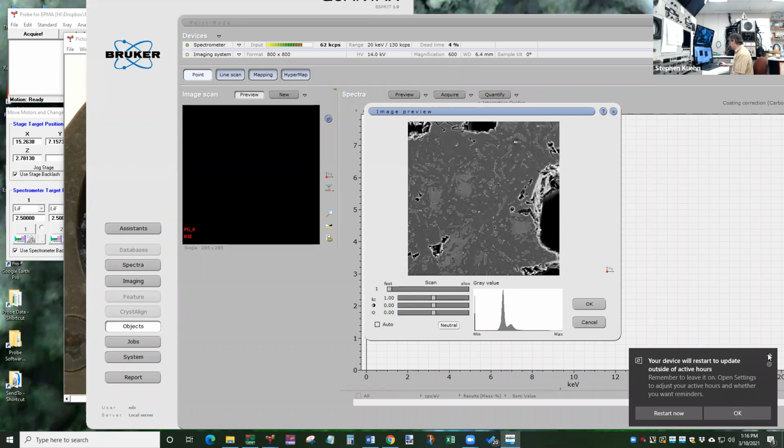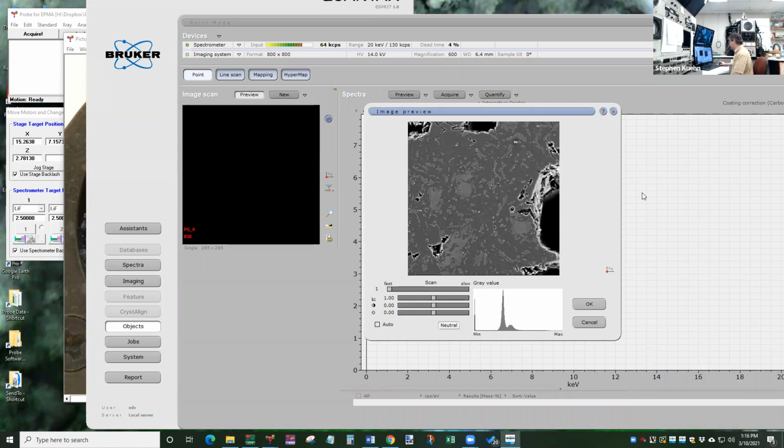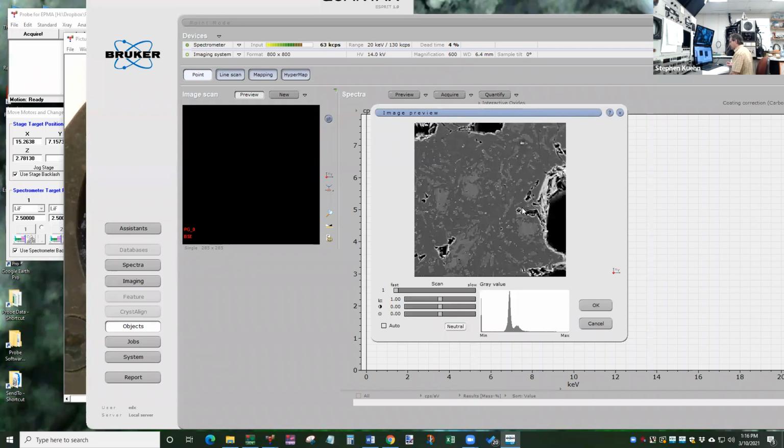I already told this thing to update twice today, and apparently it needs more. All right. We'll have that later.